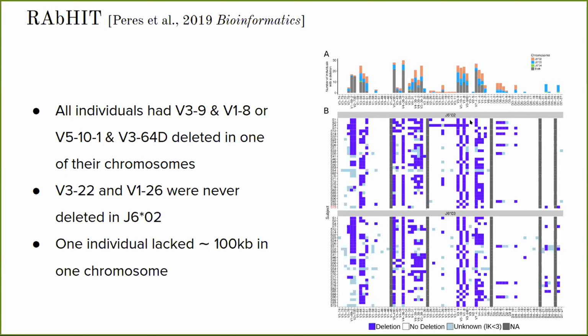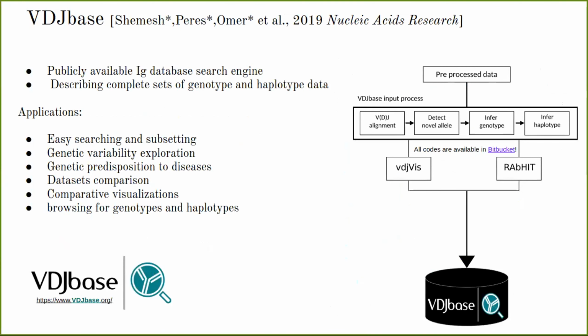So this and the other variation let us think that if we enlarge our database and recreate what we did now on a large scale, maybe we can get more information and understand better the variations and see the different patterns that we saw in 100 individuals. And for that, we developed VDJbase.